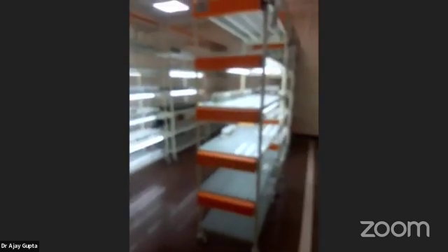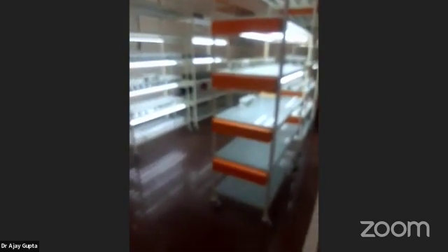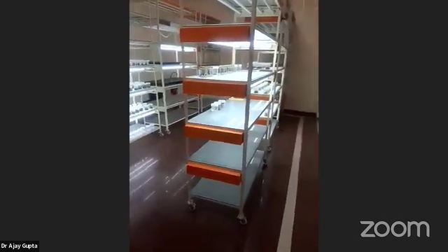So like this, there are different conditions in which they are kept, and we have to monitor accordingly. Here see the lights: different cells have different intensity of light depending on their requirement. And there are the air conditions, alternate air conditioning day and night, because we have to maintain the temperature. And the humidity is maintained within this site. So light is there, temperature is there, and humidity is there.